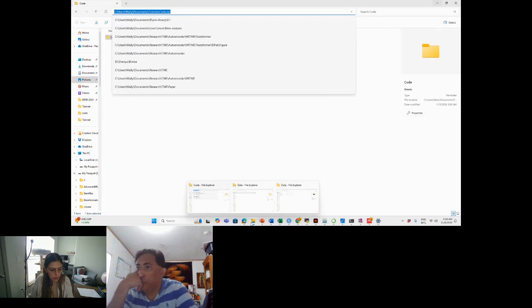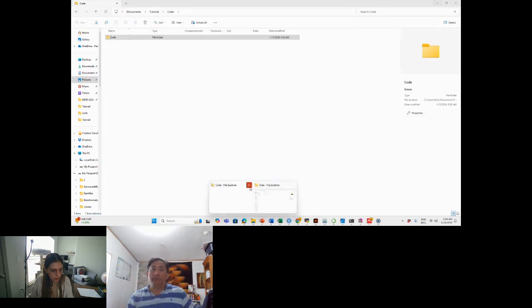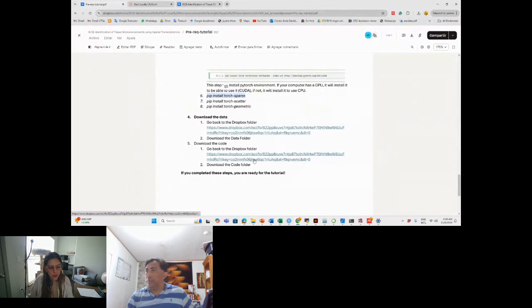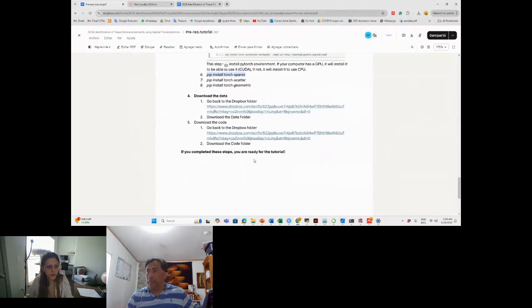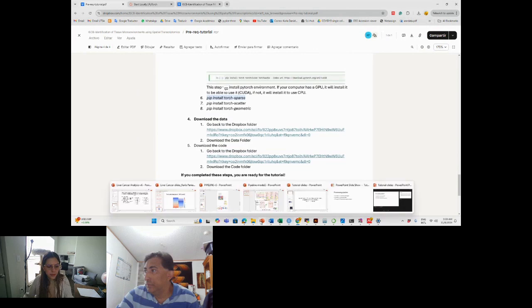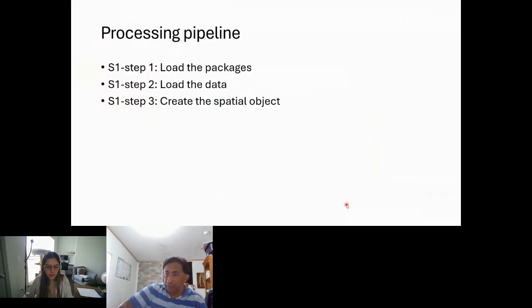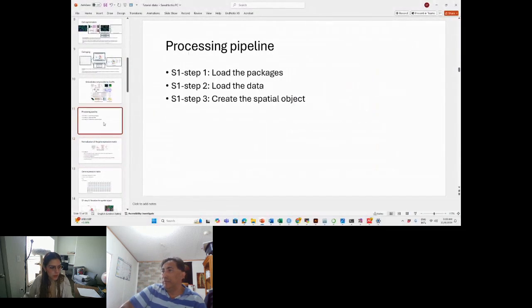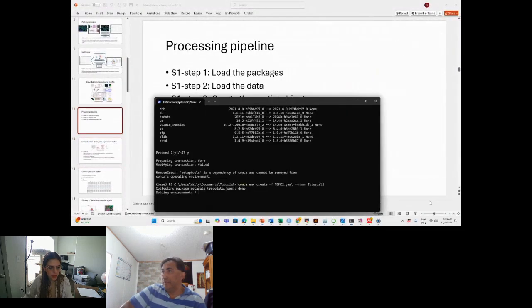Let me just close all these windows that I opened. Okay. So after we downloaded the code and we downloaded the data, we're good to go. Is everyone fine? Questions or any comments? Now you can go back to your environment to see if it's completed. Okay. It's still running.